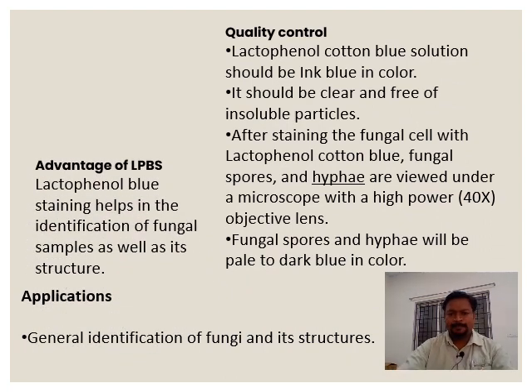Quality control: the lactophenol cotton blue solution should be an ink blue color, clear and free of insoluble particles. After staining the fungal cell with lactophenol cotton blue, fungal spores and hyphae are viewed under the microscope with the high power 40x objective lens. The fungal spores and hyphae will be pale to dark blue. Advantages: lactophenol cotton blue staining helps in the identification of fungus samples as well as their structures. The applications: general information, the fungi and structure will be identified.